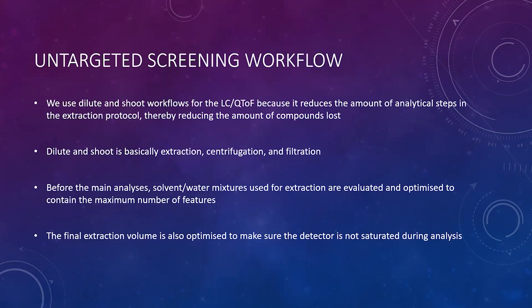So no cleanup, no liquid cleanup. We do liquid-solid, or liquid only if it's a liquid sample, and then we just extract, centrifuge, and filter, just like metabolomics. Before the main analysis, we also do solvent-water mixtures for each commodity to make sure that we're pulling out as many compounds as possible, not just for the features, but also to make sure we get all the contaminants. And again, the final extraction volume is optimized to make sure we're not saturating the detector.